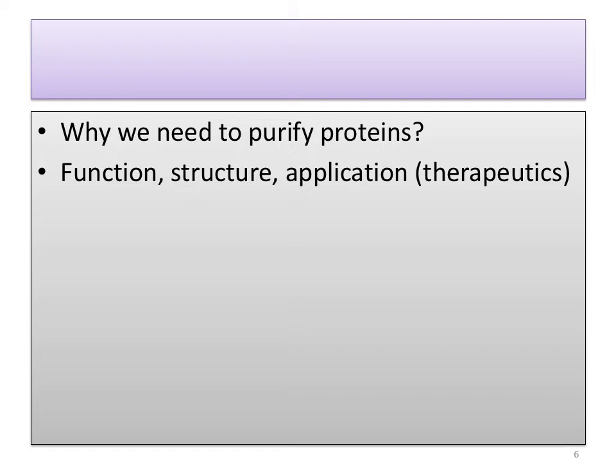So one important question in this regard is why there is a need to purify proteins. Chromatography could be used to purify proteins and other types of molecules as well. Generally, the proteins we isolate are coming from cells because proteins are produced in a cell.